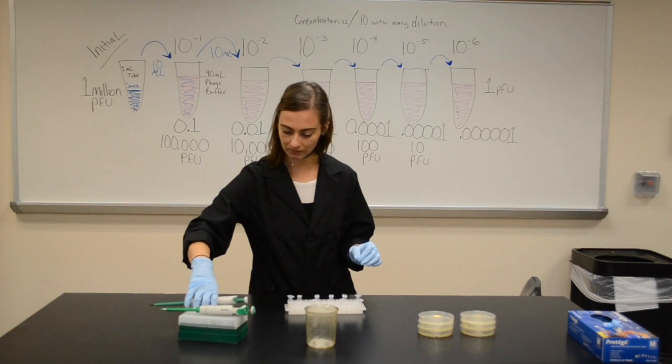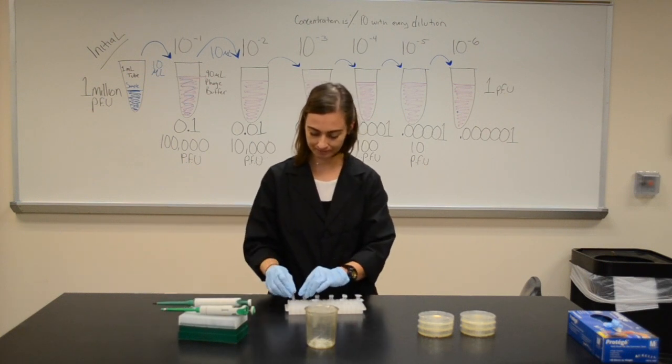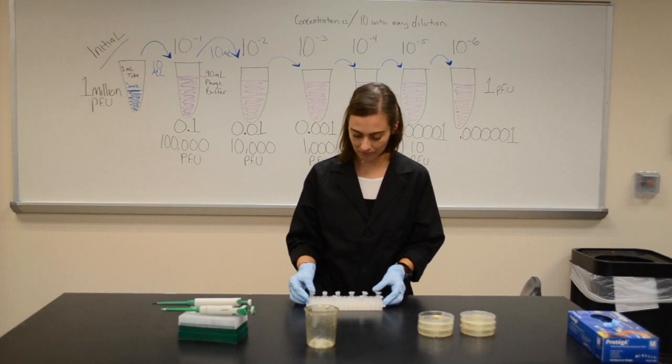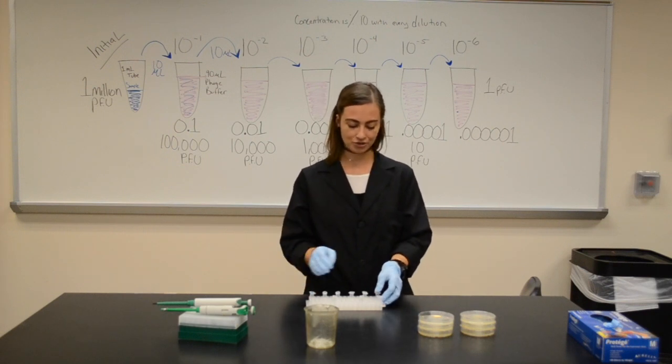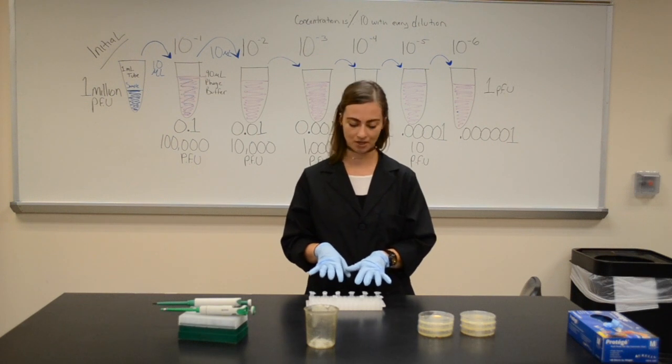Okay, so now that I have these dilutions done, I'm going to want to see what could grow on them. So I want to actually plate my dilutions that I've done.